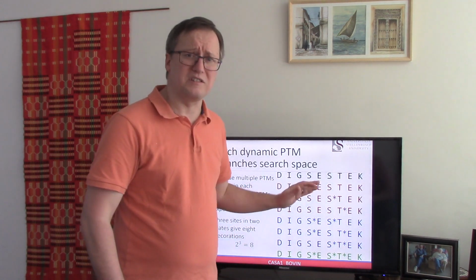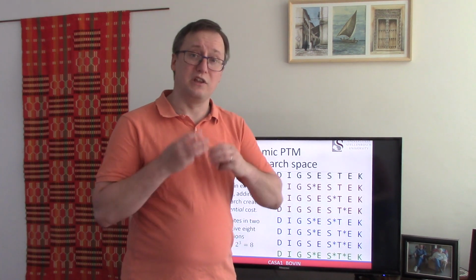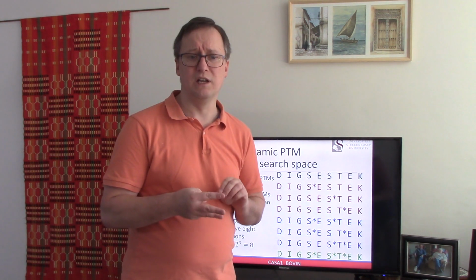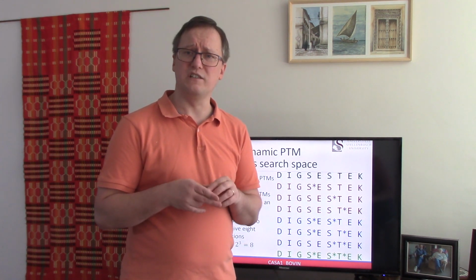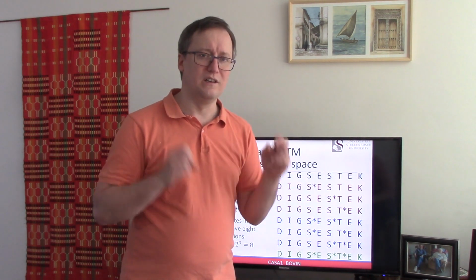Now I would note that some people who do really advanced kinds of phosphosearching consider actually 3 possibilities for serine, threonine, and tyrosine. It could be that we have something called beta elimination that causes the phosphoserine to throw off not a phosphorylation, but phosphoric acid.